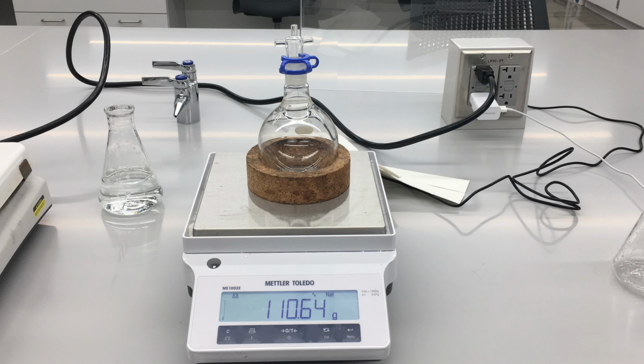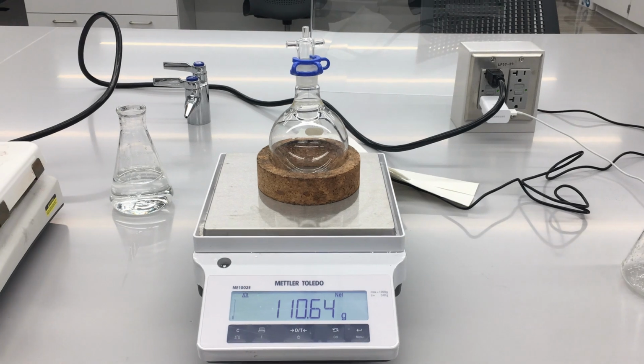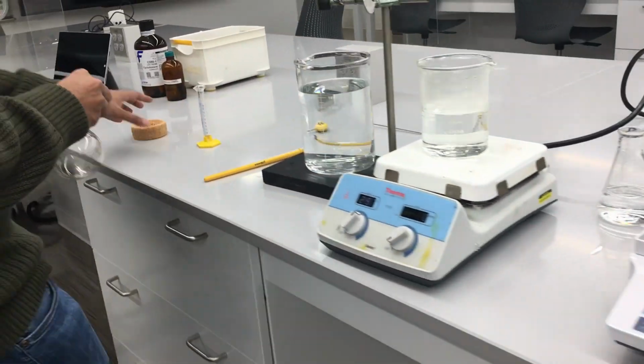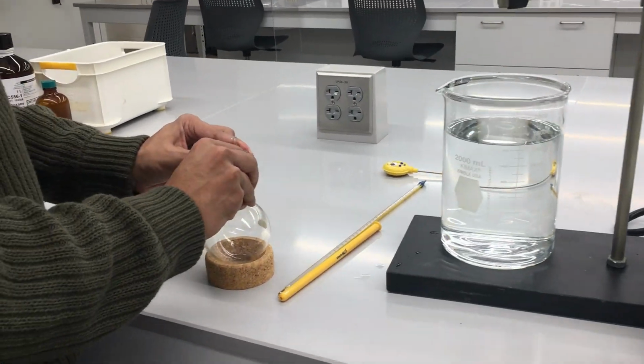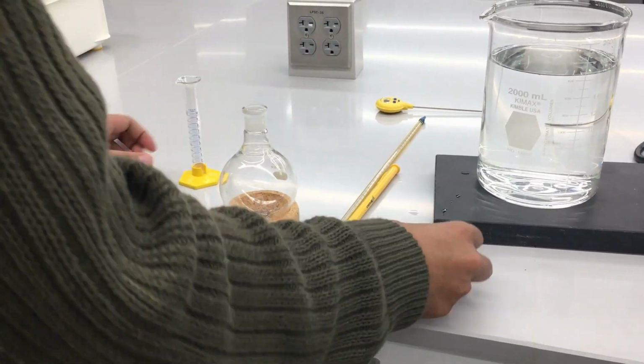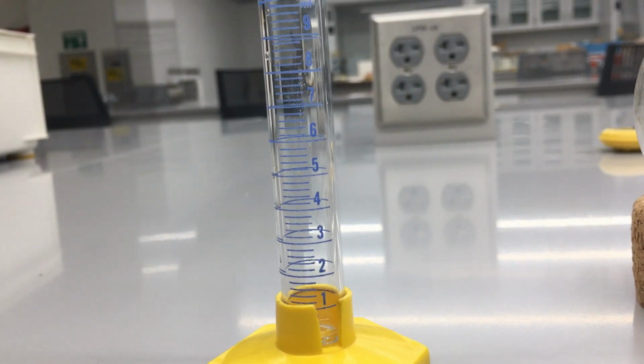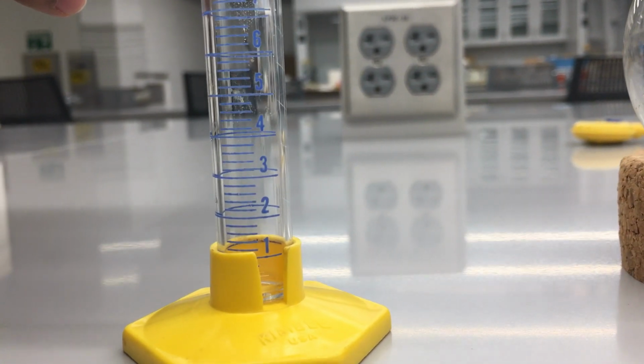All right, and then finally for trial 3, our initial mass is 110.64 grams, and that is of our empty round bottom flask. We will go ahead and repeat the steps that we did for the past 2 trials and measure out about 5 milliliters of our unknown volatile compound.